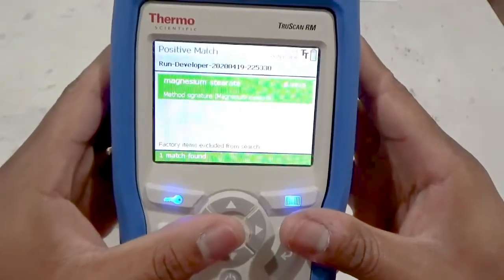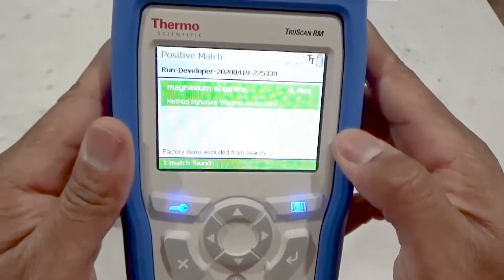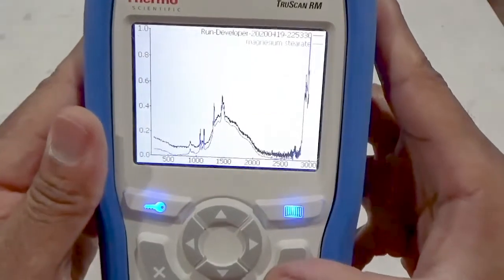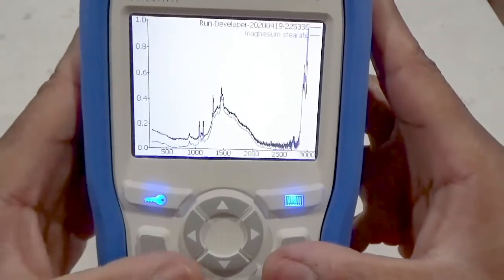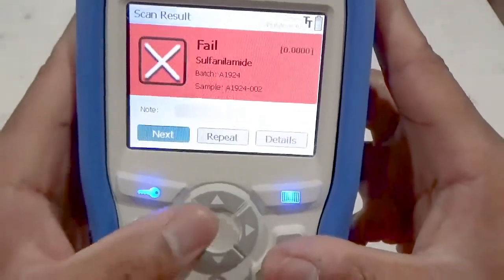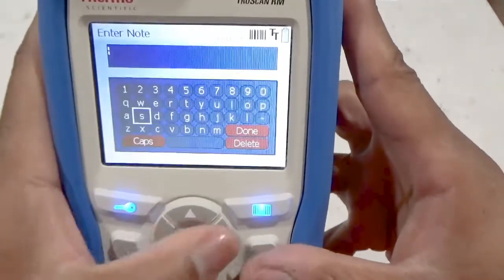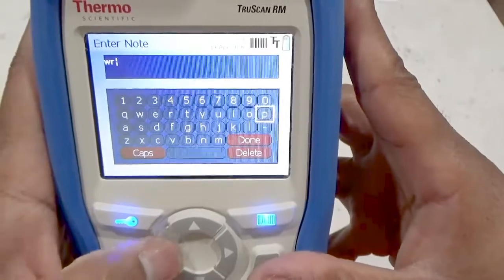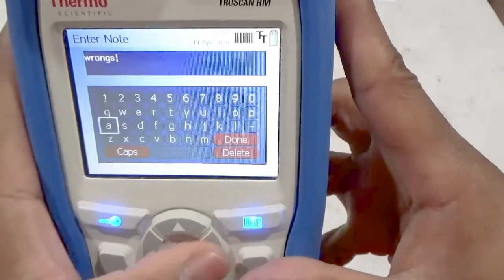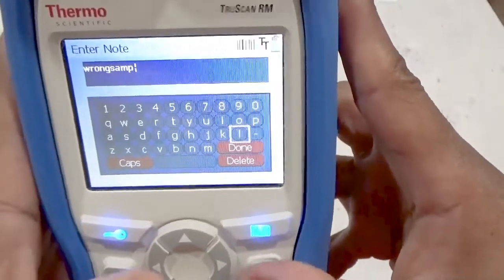If we select the details option and press enter, the instrument proposes positive matches for the material's ID with p-values that show strongly confident match results. Press the enter button and select view spectrum to see an overlay of the sample spectra in black with a positive match in blue. Press the cancel button to get back to the results screen, where the user may enter in a pre-programmed note set by the administrator or may enter one of their own. You can also use the barcode reader to enter in your own note quickly. Highlight done and press the enter key to get back to the result screen with the note appended.